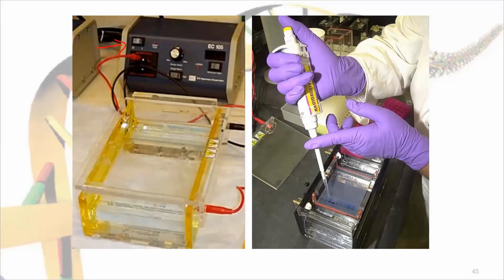Okay, you can see here they have put one electrode here and another electrode here, right? In the second diagram, this is a whole chamber where there will be a buffer, and this slightly translucent part which you are seeing is a gel. This is a gel slab.